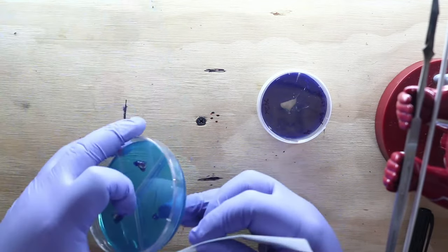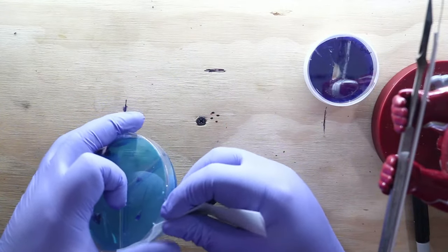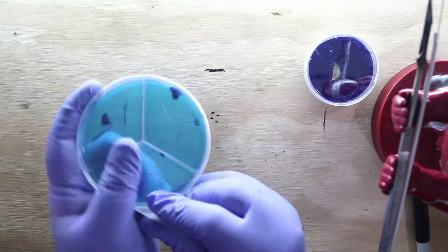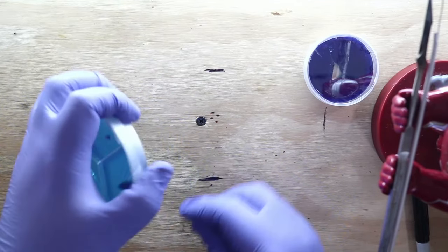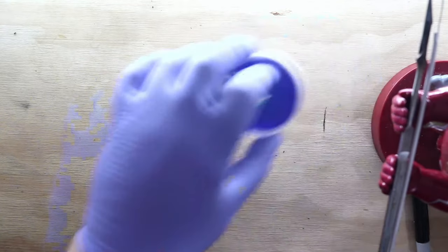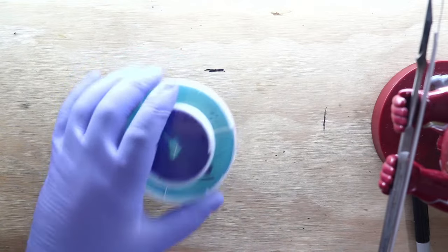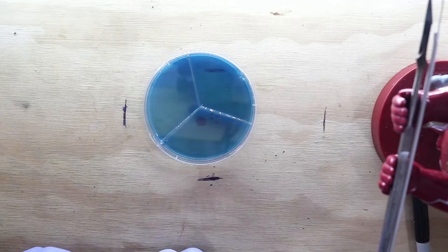I think every grower, cultivator, researcher, anyone working with microbes should learn how to hand pour plates. But my goodness, it is so amazing once you've hand poured a bunch of plates to be able to use a peristaltic pump and just pump out like 200 slants in like 30 minutes. So, all right, now let's do an LC quality control test. This may be the easiest thing we do in our entire facility.